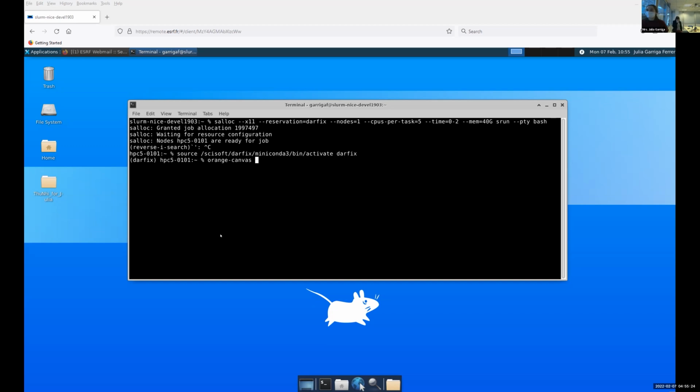I hope everyone else was able to open. Emilio, are you in orange now? Were you able to open it? Yeah, I made the same mistake. So I just connect onto Slurm and then it seems to work. Okay, good. So let's try from there.